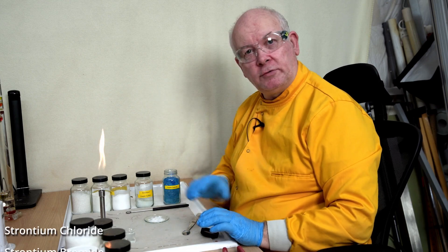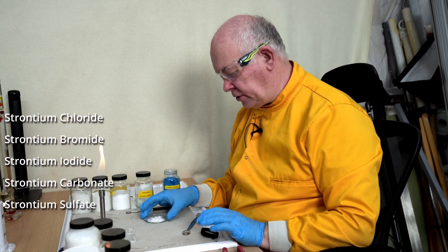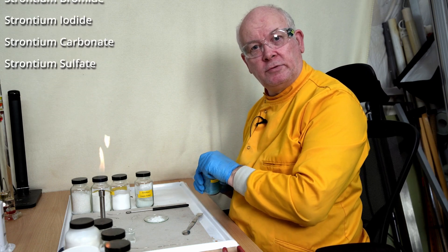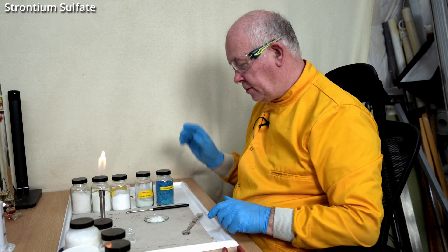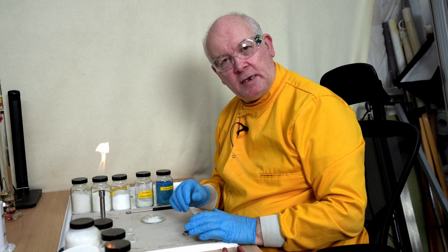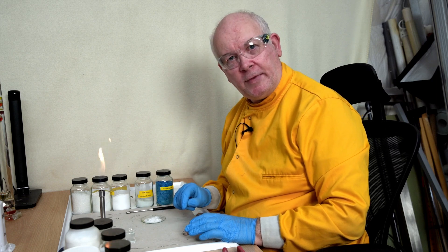But strontium what? Is it strontium chloride? Is it strontium bromide? Is it strontium iodide? Is it strontium carbonate? Is it strontium sulphate? What we need to do is a whole series of tests now to determine which one that is.